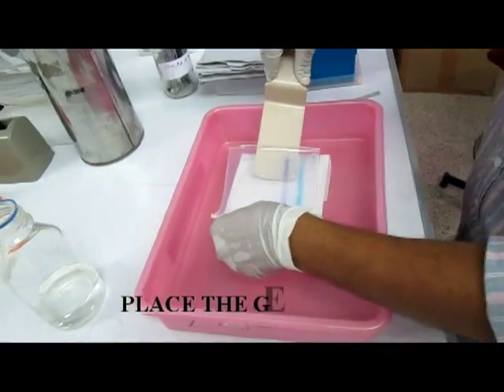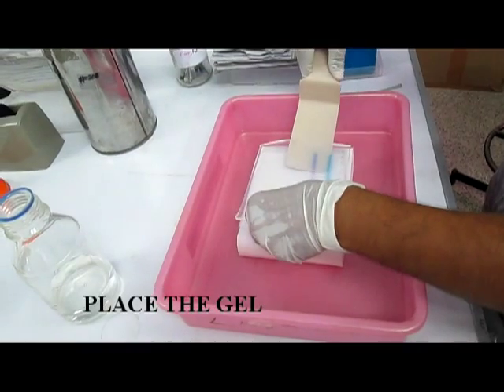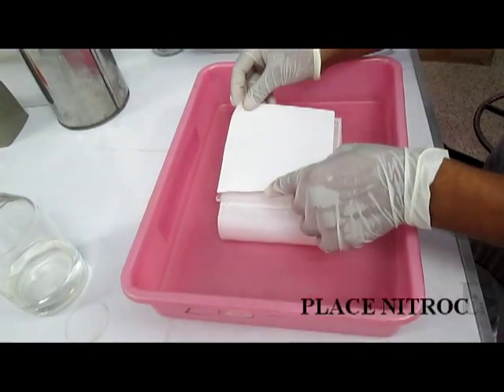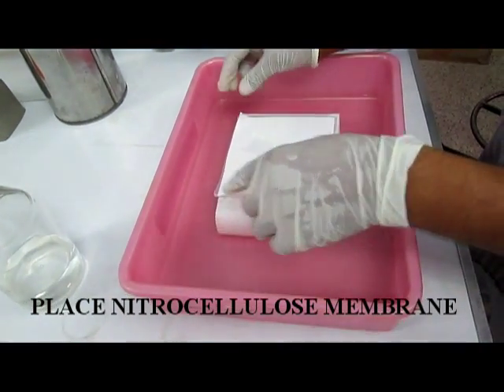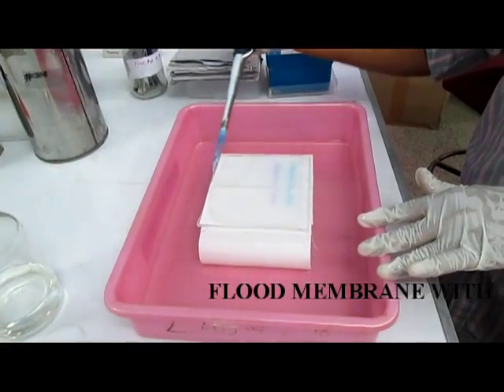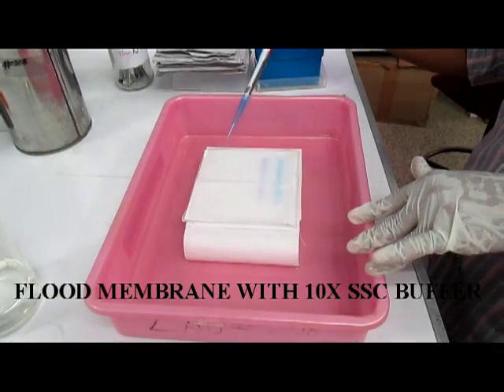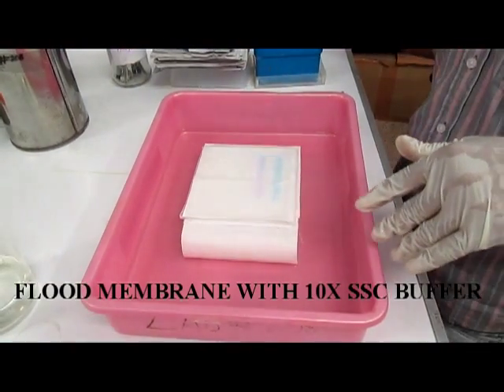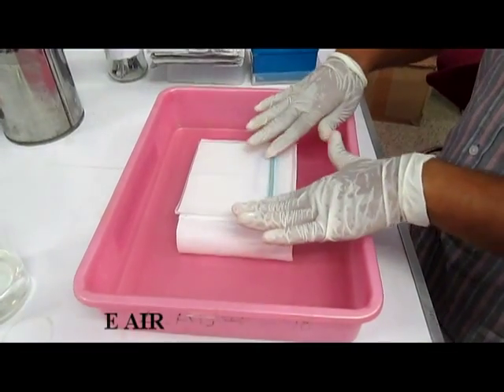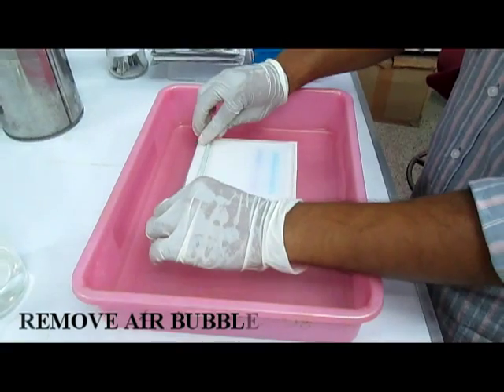Then place the gel onto the Whatman paper without any air bubbles. Put the nylon membrane over the gel having the same size. Then soak the membrane using 10x SSC buffer, and remove the air bubbles by passing the glass rod over the membrane.